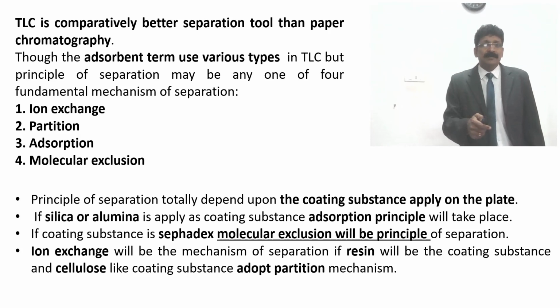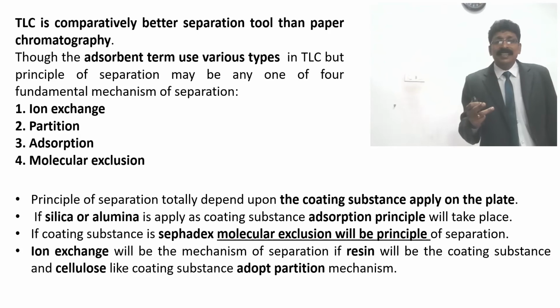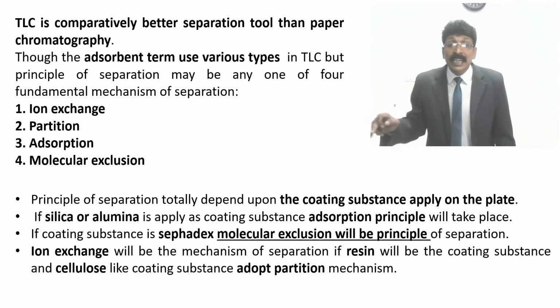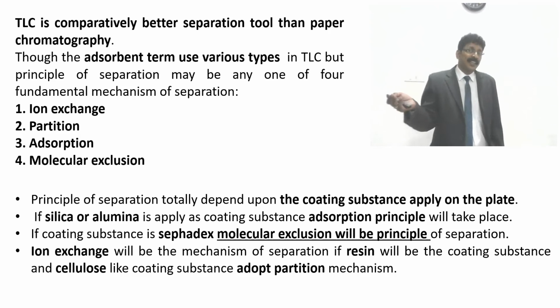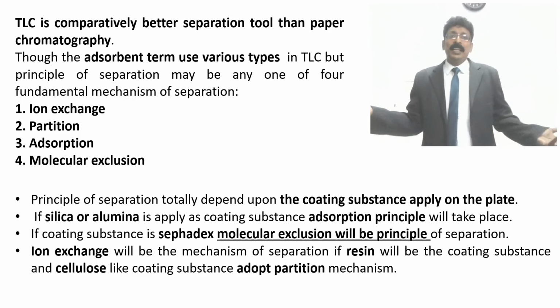And in the same TLC, if you are using ion exchange resins as a coating mechanism of separation, if the resin is coated as a substance on the thin glass plate, then it will work as ion exchange chromatography. If you are using cellulose as a coating, immediately it will work as partition chromatography.